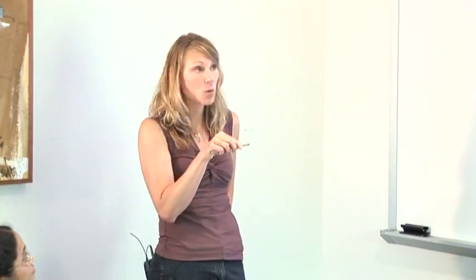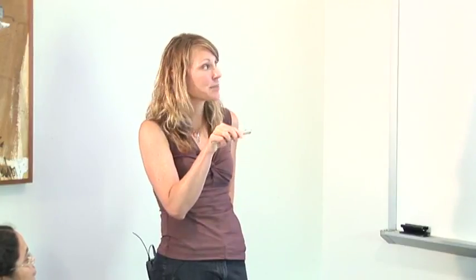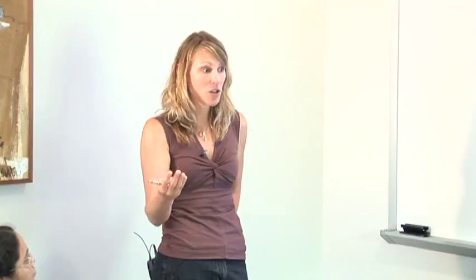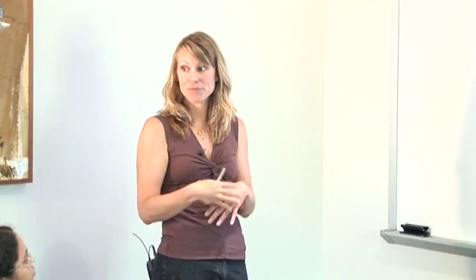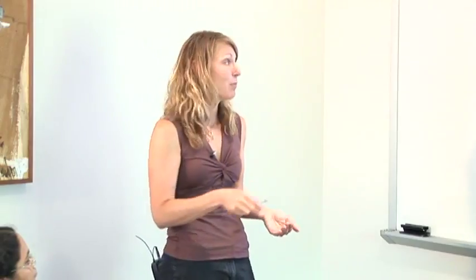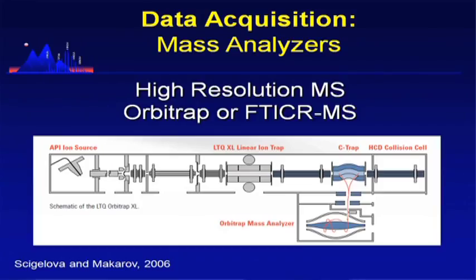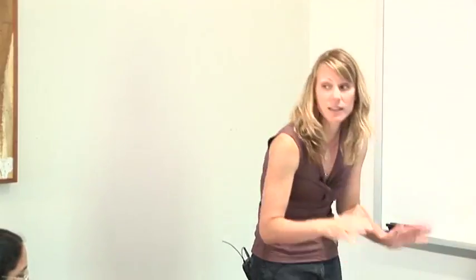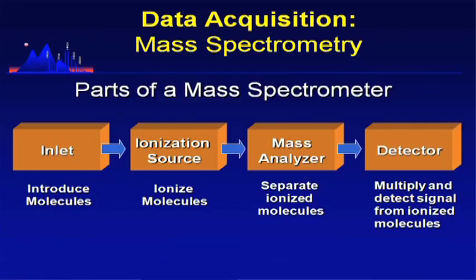Okay, so they're becoming more and more popular and making this concept of high resolution or high mass accuracy mass spectrometry more generally used. So you'll see it a lot in the literature, that more and more people are doing this, and it's sort of where the field is going as they become more and more affordable for the general researcher. Okay, and that was just supposed to be a little primer about the cool stuff, but that we're not going to use in the class.